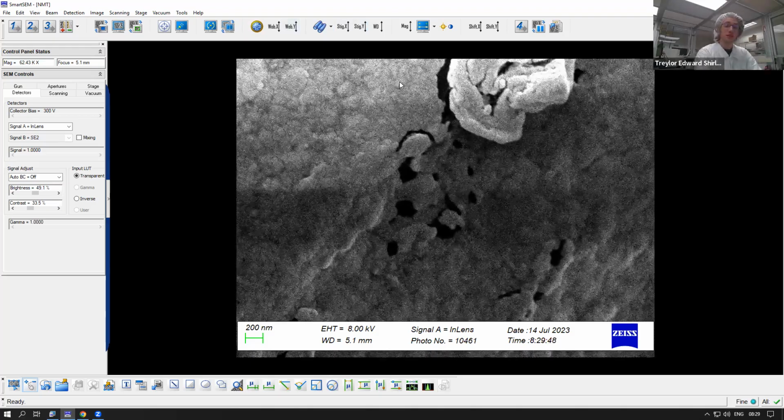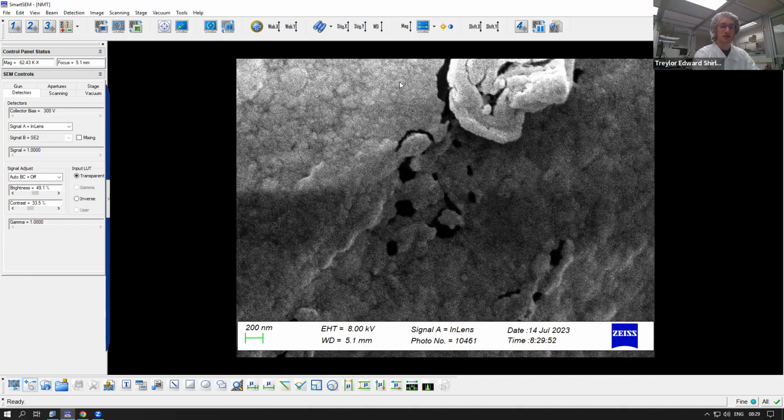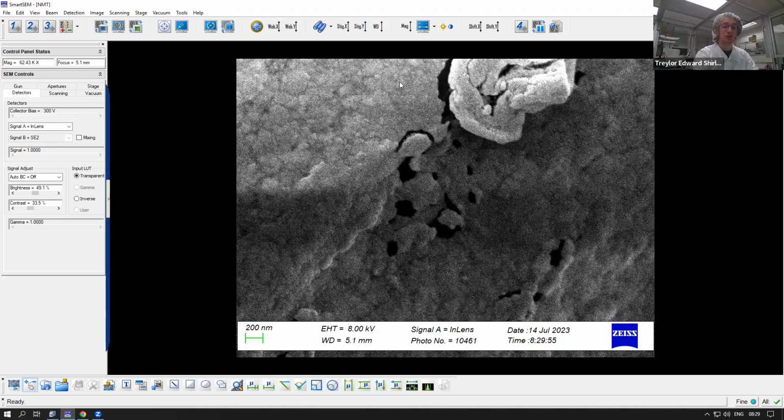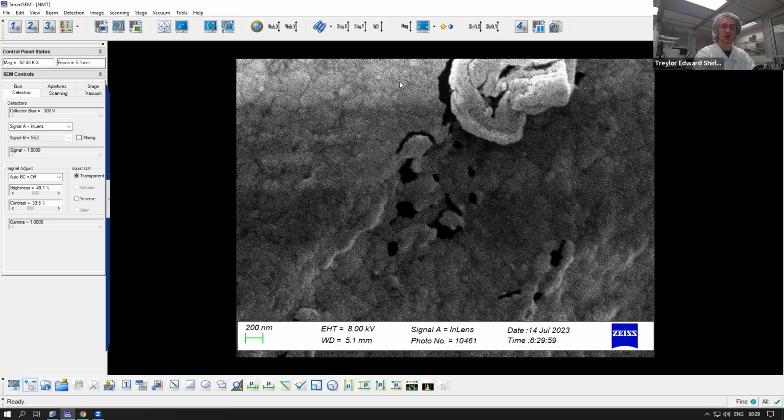And that's generally the capabilities of our FESEM here in the CNEU clean room at Penn State. Once again, we have multiple different samples that we can do upon request, in addition to being able to process your samples that you may send in to us.